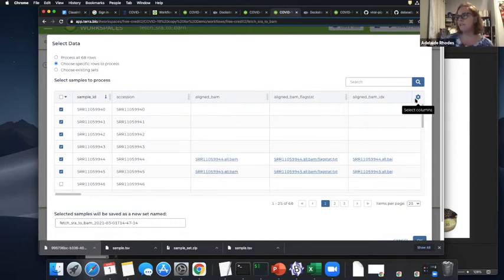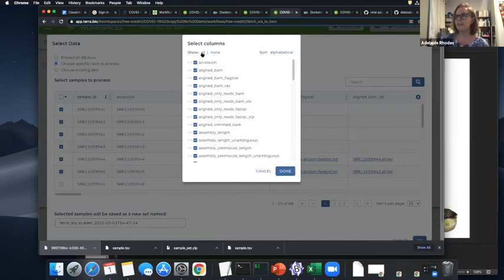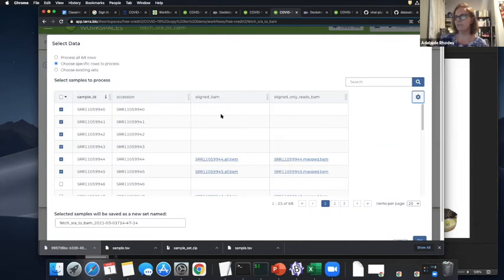And then, like I said, there's cool little things here. You can hide columns. So I could just have this and just have like that. I could just have three or 4 columns that I've selected. So you can hide the columns. They're still there in the underlying data table, but that might be helpful when you're trying to design the next step of the workflow.